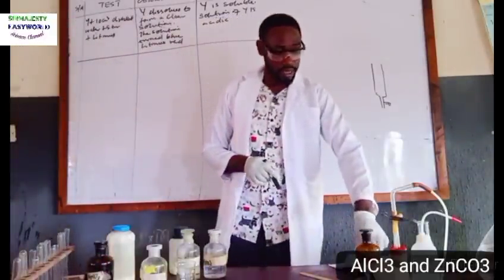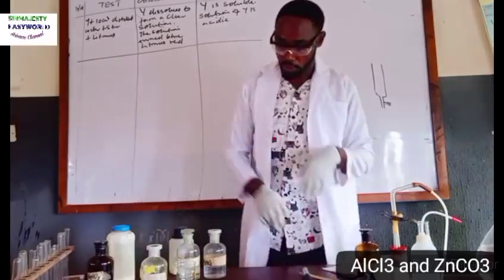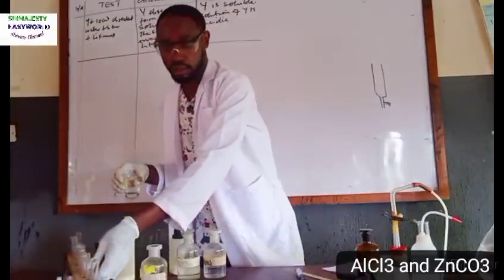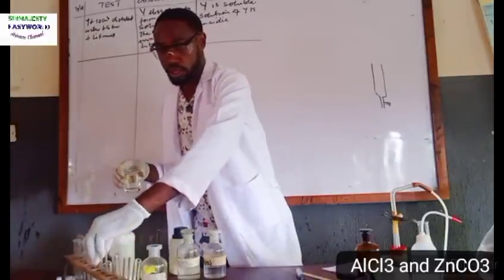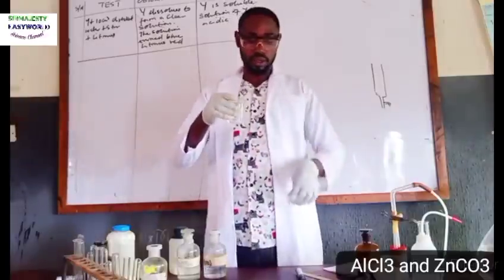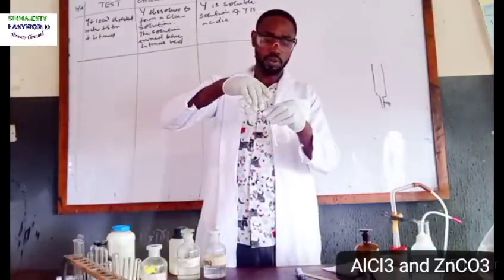Then the other step said, divide into four portions. Over here, I have the test tube. So to the first portion, I'll be using this as the source. I'm taking the first portion.